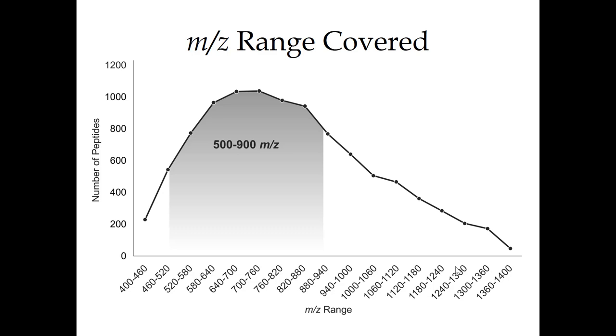And you don't have to spend time on the range where you have fewer things. That's right. Less points across the peak, or you're going to start acquiring slightly lower quality data basically as you move that window further and further out. Our lab does tend to sample a narrower range. I would say it's a lot more popular to do like 400 to 1,000. But this is the decision we've made for a lot of proteins. We can still get 1 or 2 unique peptides, and for those peptides that we do measure, we get very good quant.